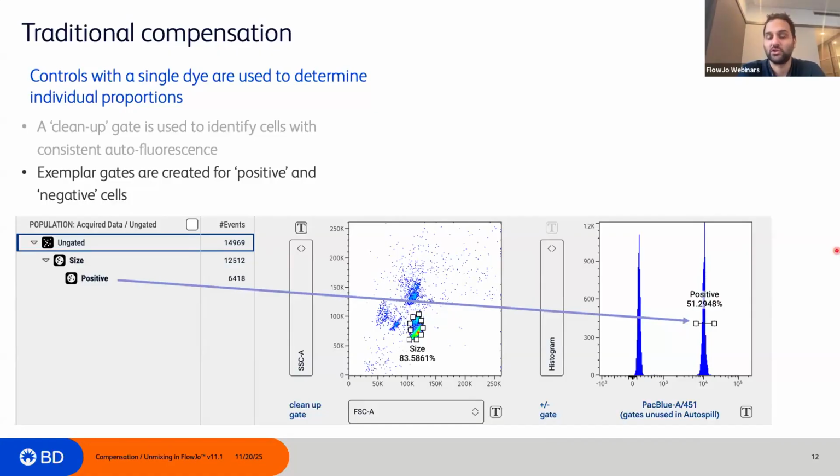So all this is also possible in version 10, all this that I'm showing here. It's a bit optimized, as I'm going to show you later, in version 11, but you can of course do everything in version 10 as well. But in the next steps, you're going to see how version 11 is a bit more optimal. I hope I answered your question. I didn't know what exactly was the topic, but I'm guessing you're referring to the compensation wizard.